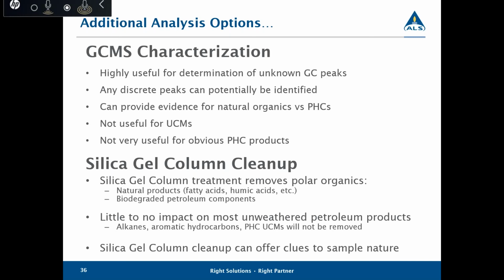Silica gel column cleanup treatment will remove the polar organic compounds from the sample, so fatty acids, humic acids, and also if there's a biodegradation of petroleum components, those will be removed too. It will have little to no impact on most unweathered petroleum products like alkanes and aromatic hydrocarbons.